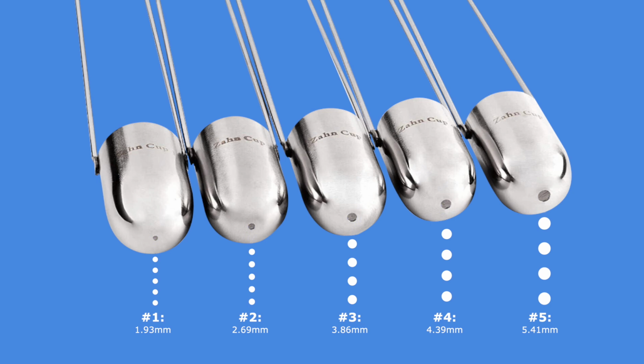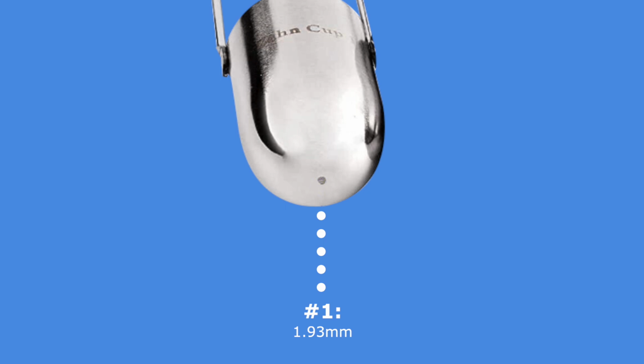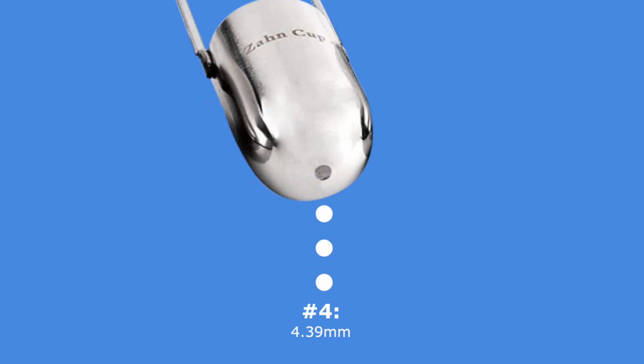There are many manufacturers of Zahn Cups. The cups are supplied with various orifice sizes. The smallest, a number 1 Zahn Cup, has the smallest orifice and is used for very low viscosity fluids. The largest orifice, a number 5 Zahn Cup, is used for very high viscosity materials. In the coil coating industry, the most common Zahn Cup is number 4.